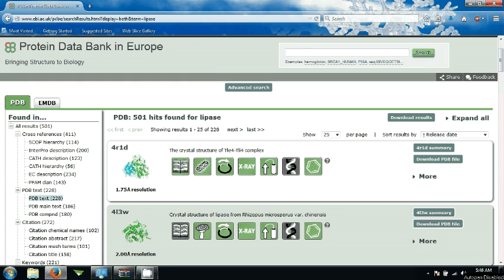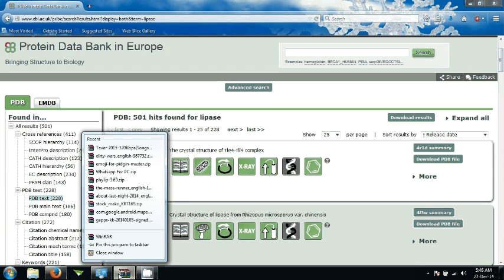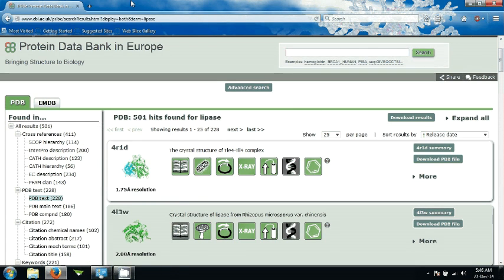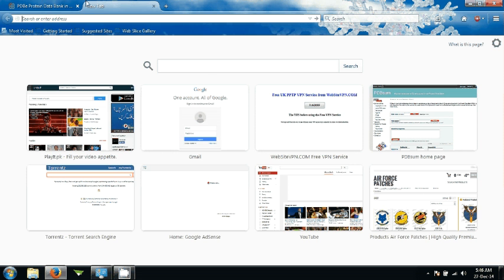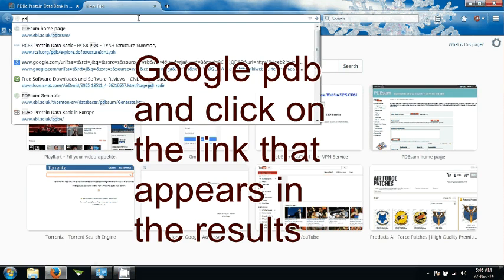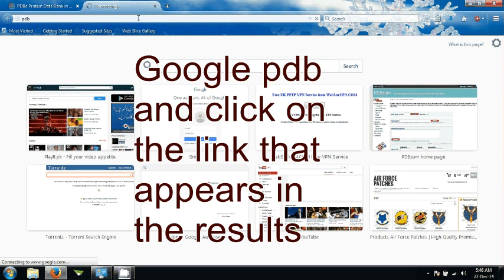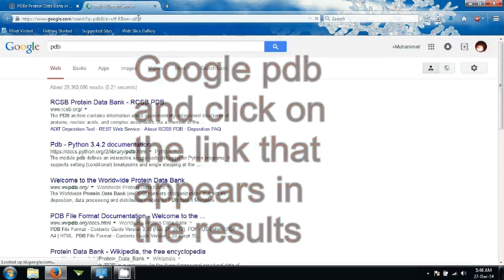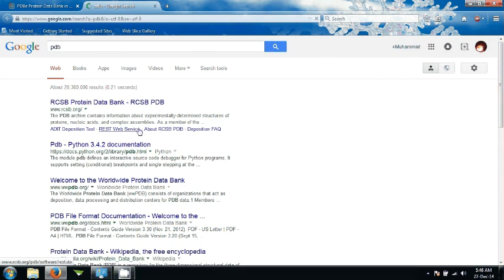Alright, for this experiment or practical, first of all you need to go to Protein Data Bank in Europe. You can do that by just googling PDB and it will lead you directly to this page.